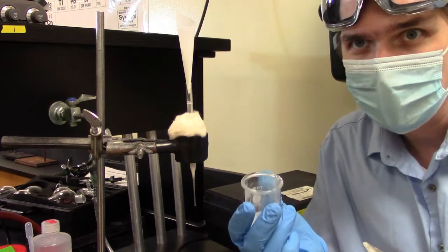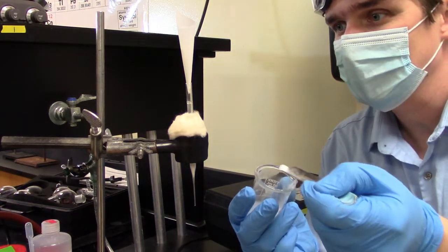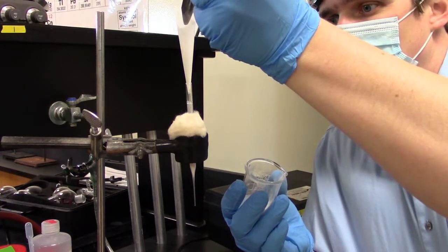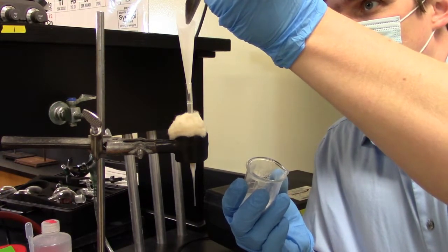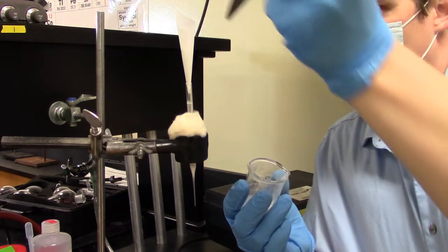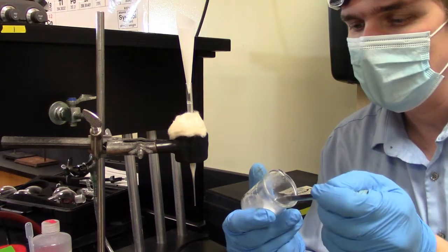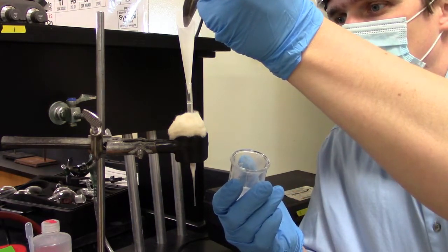Also, don't be like me and start getting impatient and try to cram a whole bunch of silica gel in there. Because remember, once you put it in there, you can't get it back out. There we go. We want to leave about a half centimeter of headspace to add the sand. And the sand is just kind of there to protect our silica gel when we start adding the solvent.